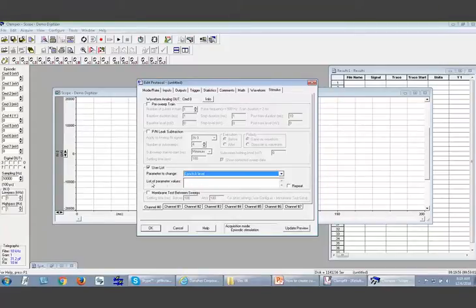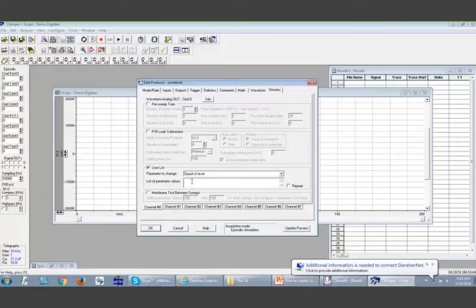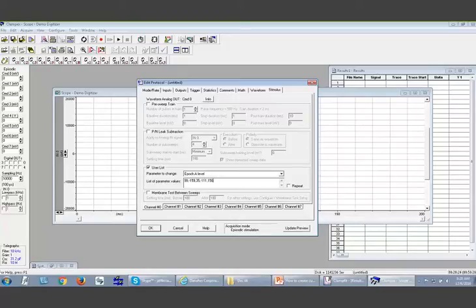Now you select it, then you list the parameter values. Now I want the first sweep to be, for example, 99 millivolt. Then I put minus 159, and I can put 35 and minus 111, and I can go back to 156, and then you can go back to minus 10. Then, for example, I can go back to 145. How about that? So I make 1, 2, 3, 4, 5, 6, 7 traces.